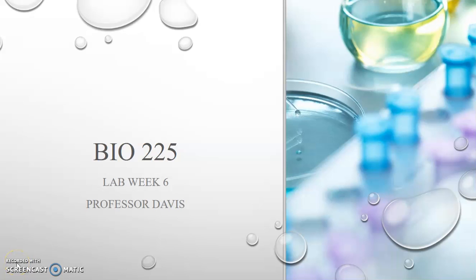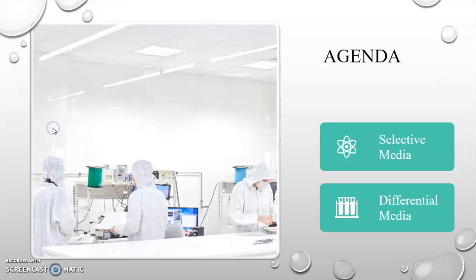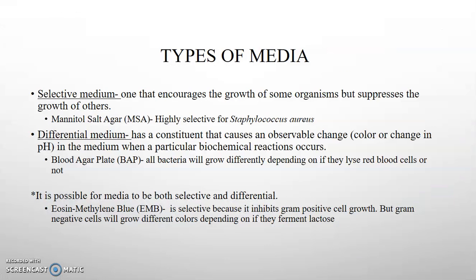Everyone, and welcome to Lab Week 6. This week we're going to be discussing selective and differential media.